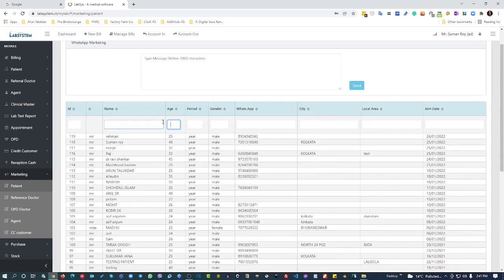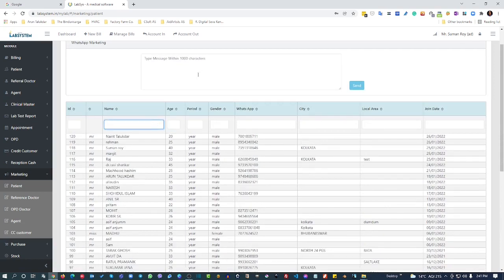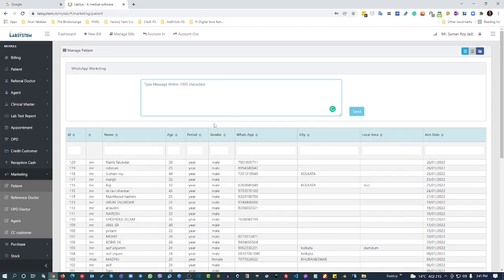So we can sort like that, or maybe I can send some information like some custom message, maybe XYZ doctor will visit our center next week.